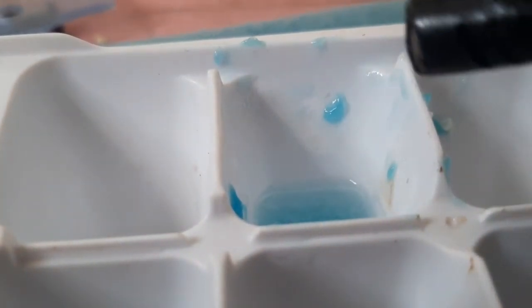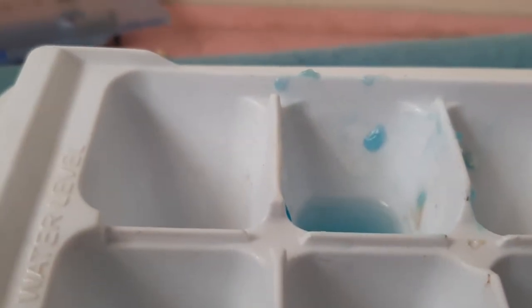It's burning up very well. Okay, it has got a flame. It's still burning up, and you cannot see it because it's a blue flame. Okay, now it's gone, and you can see the detergent smell everywhere. This is because when it reacts, it also creates some chloride substances, and this actually creates a salt over here.